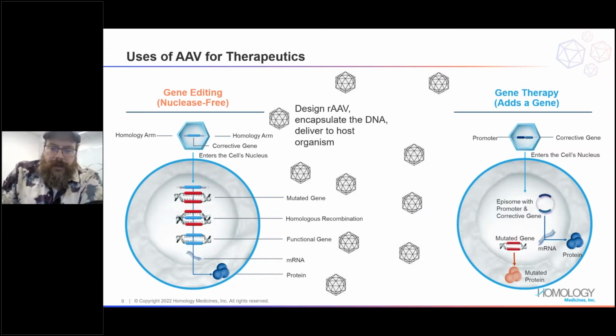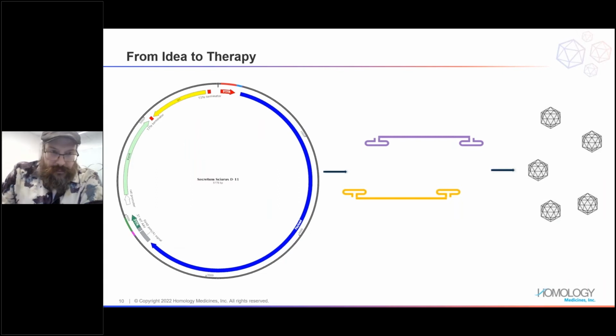So how that applies to us is, again, we go from these ideas to wanting to generate a therapy. We can see here a conceptualized plasmid that I just threw together for this talk. You've got these plasmids, and they are peeling off your positive and negative strands. You've got ITRs that need to be on either end of that, the blue circles you can see in the red and the green labeled ITRs. Those are your hairpin pieces, which are necessary, and those, of course, drive you getting a fully loaded capsid.